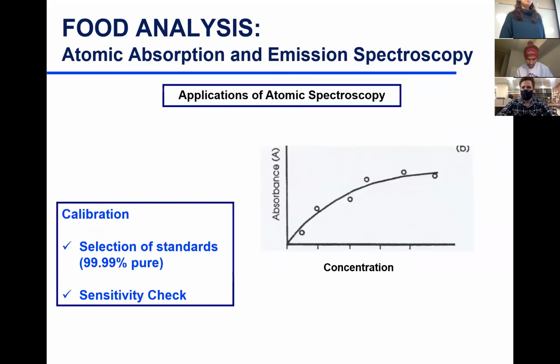All right, so this is where I stopped last time, when we were talking about preparation of your sample and also preparation of standards, cleaning of glassware, sources of errors, and all of that. And we stopped here with calibration.